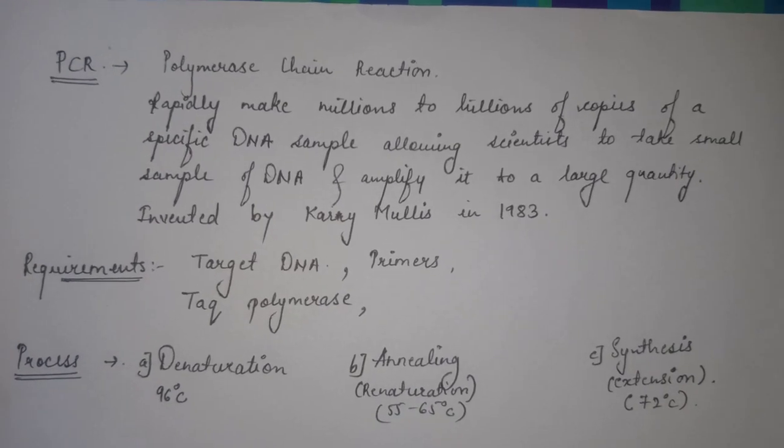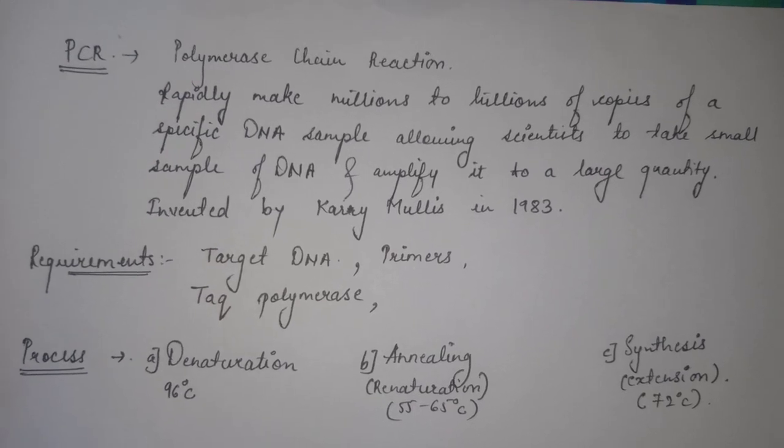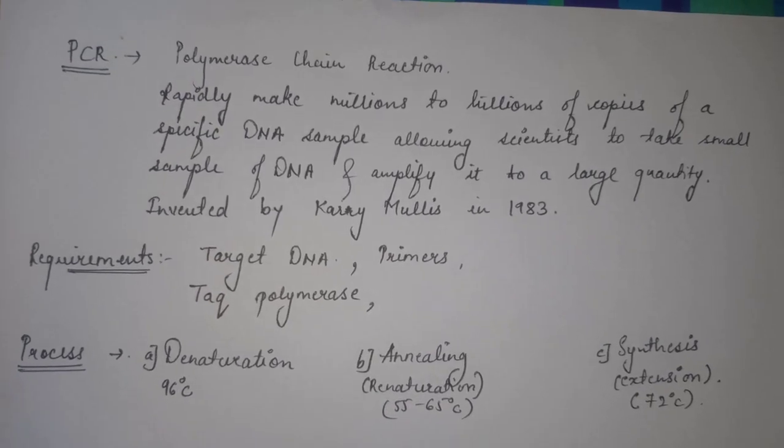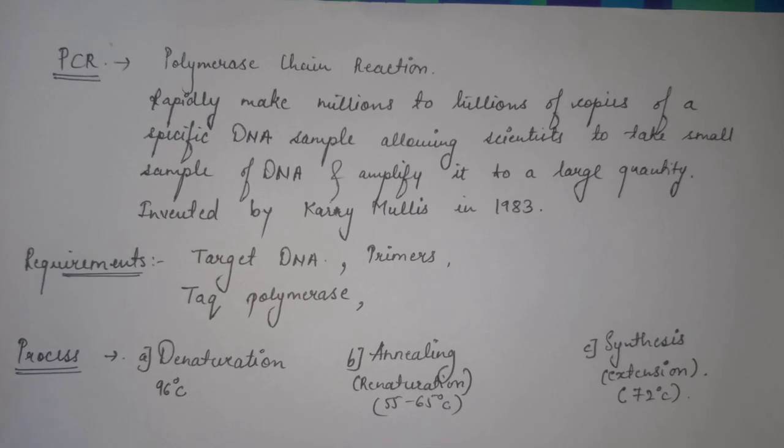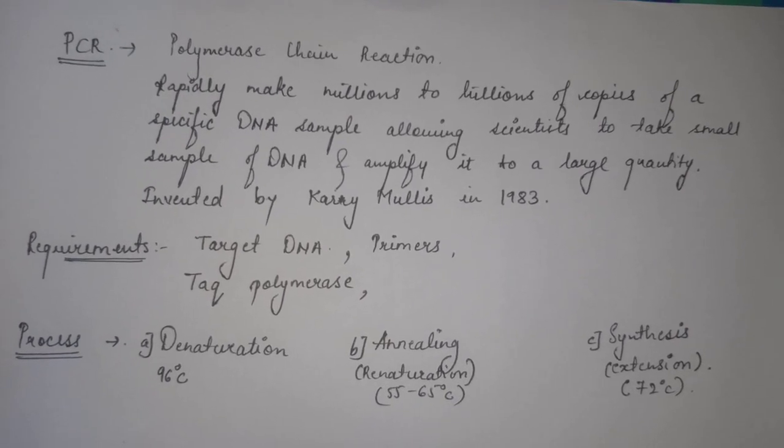Hello friends, today we are going to see a molecular tool known as PCR. PCR is nothing but the polymerase chain reaction. This molecular tool is used for amplifying the DNA fragments of our interest.